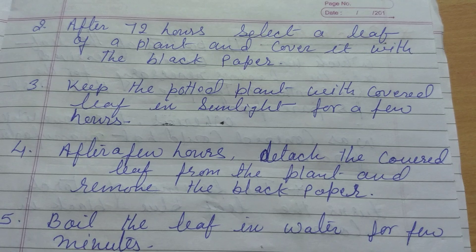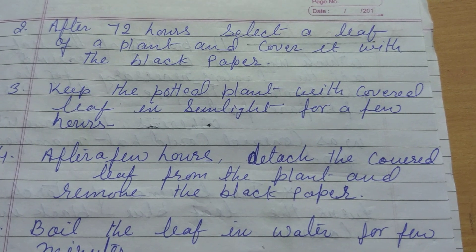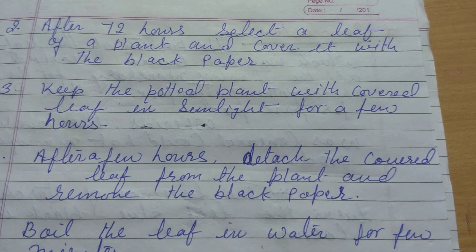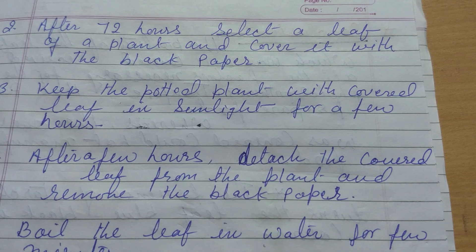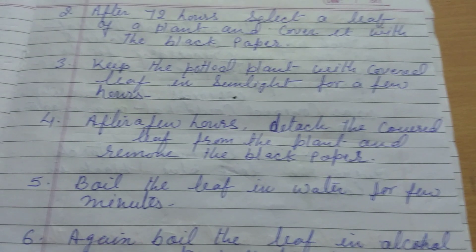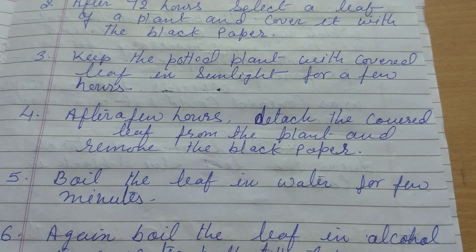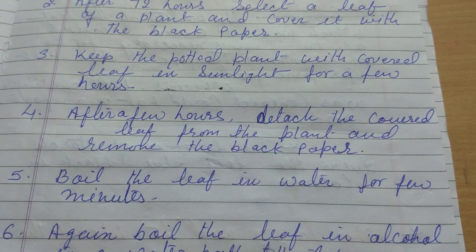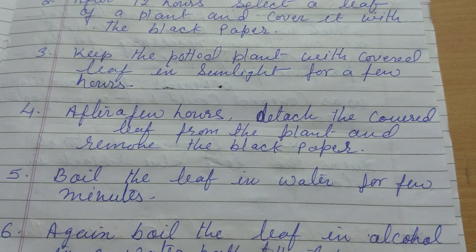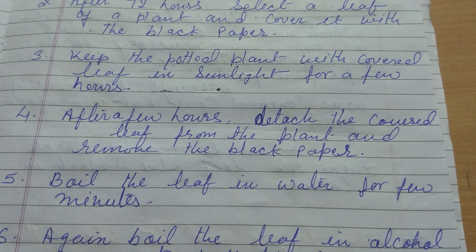Keep the potted plant with the covered leaf in sunlight for a few hours — maybe two to three hours. After a few hours, detach or pluck the covered leaf from the plant and remove the black paper from the leaf.